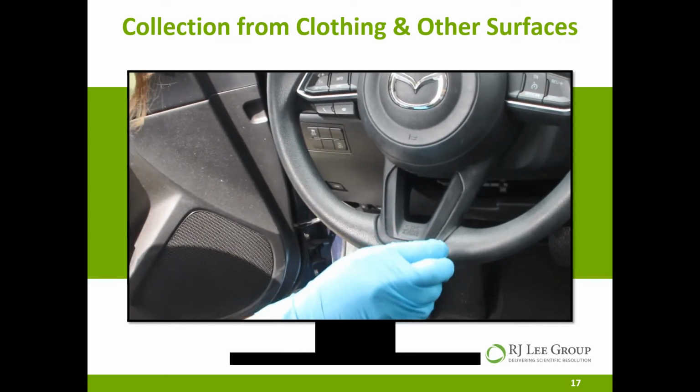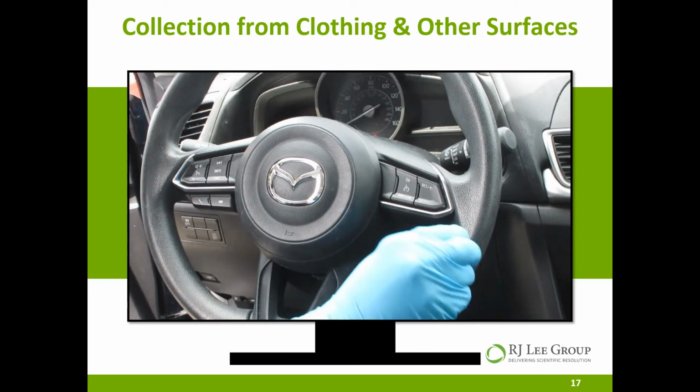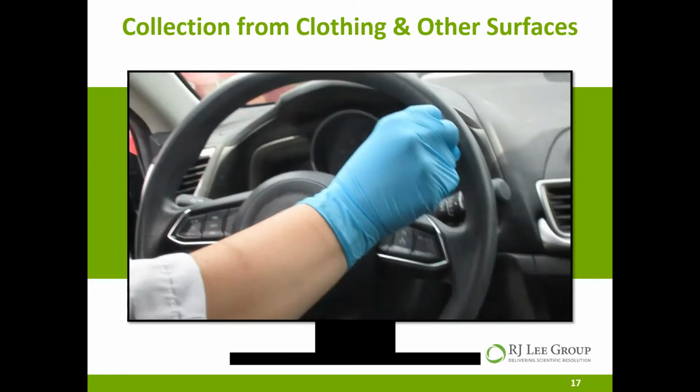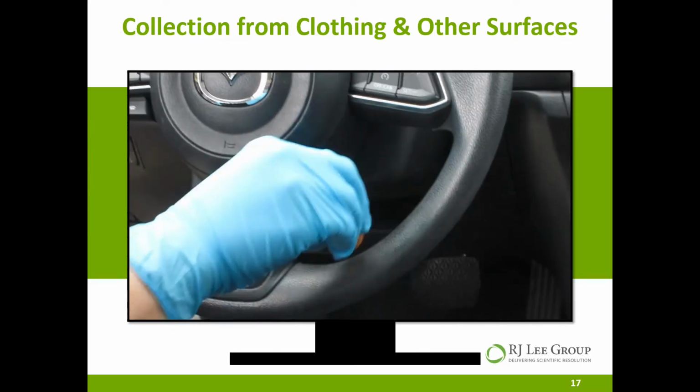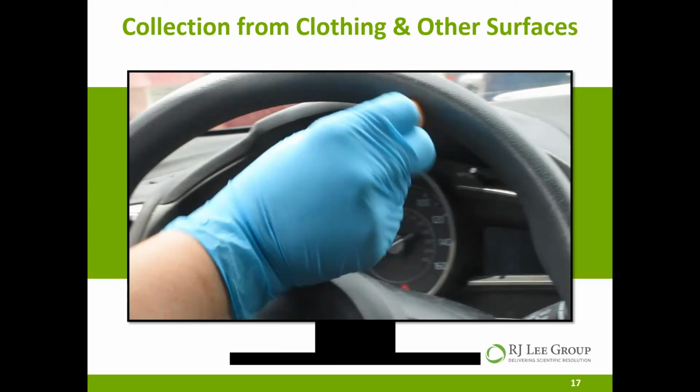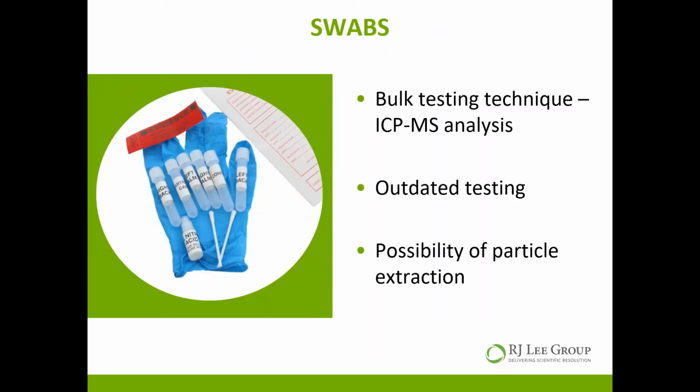So I'm starting at 12 o'clock and moving all the way toward 6 o'clock and back, just getting as much area as possible. And then I will do the other half of the steering wheel. So this is just a nice example to let you know that there are lots of different surfaces and areas that you can collect from. Again, ensure that you're wearing the proper personal protective equipment whenever you do that.